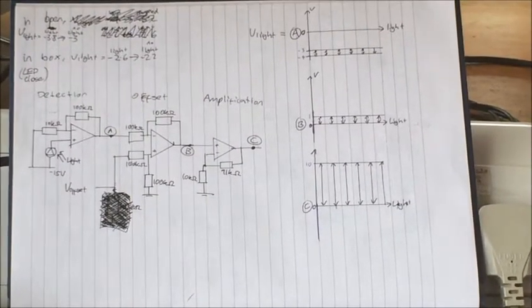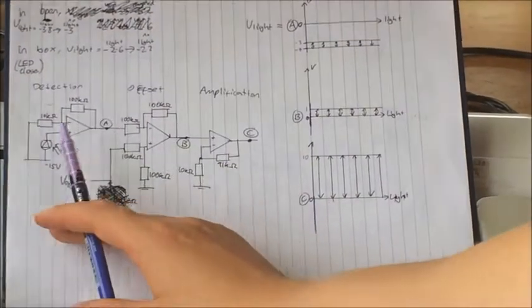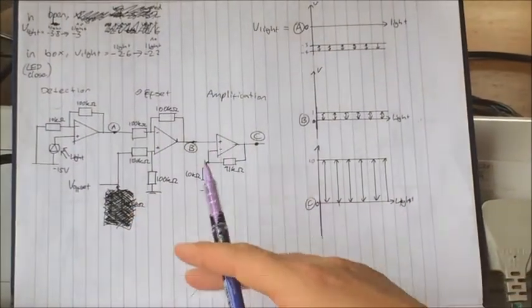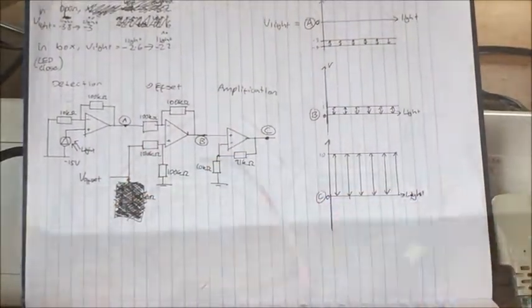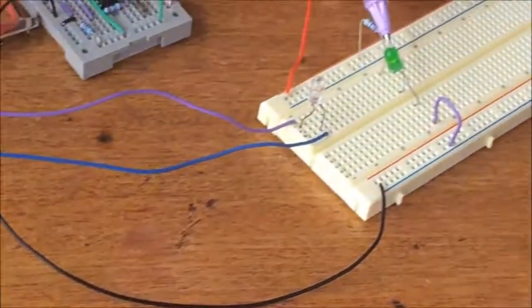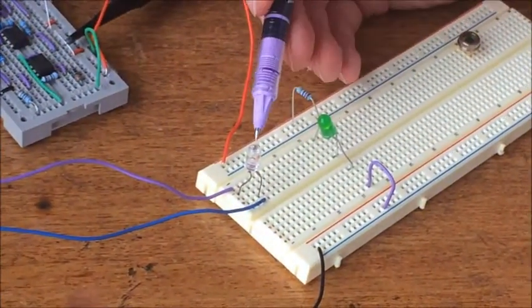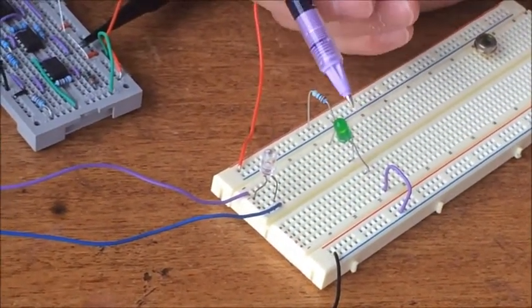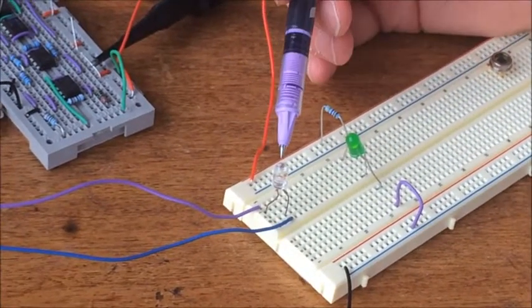This is my light detecting circuit, split into three parts: detection, offset, and amplification. First, I'll talk about detection. Our light from GFP, represented here by a green LED, is incident on our photodiode. The light goes from here to there.